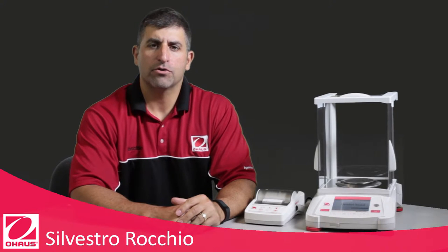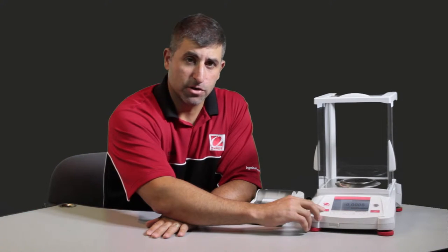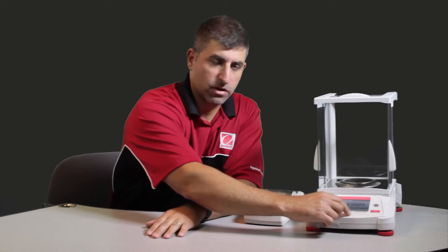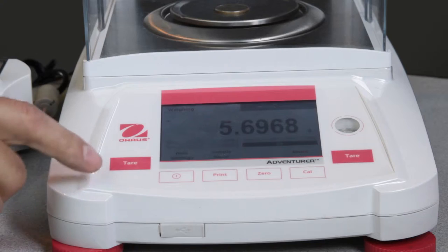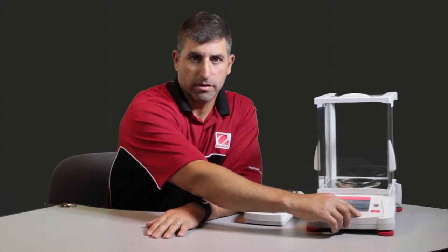Here we are with the all new Adventurer AX precision and analytical series of balances. The Ohaus Adventurer has a color touch screen display with additional keys on the side, with tear, print, on/off, and calibrate.